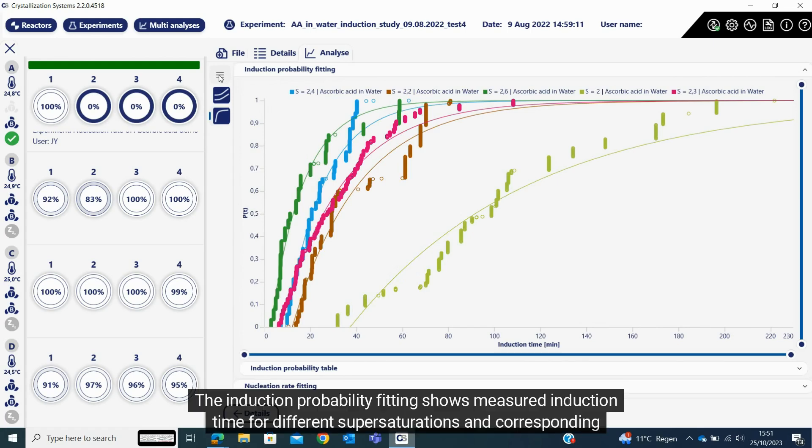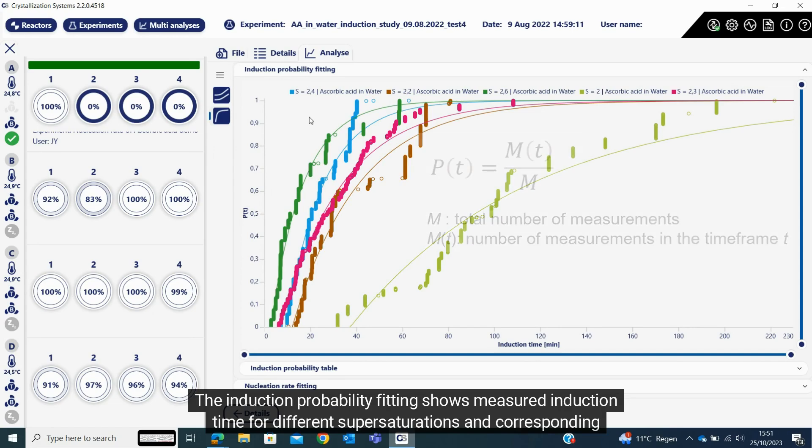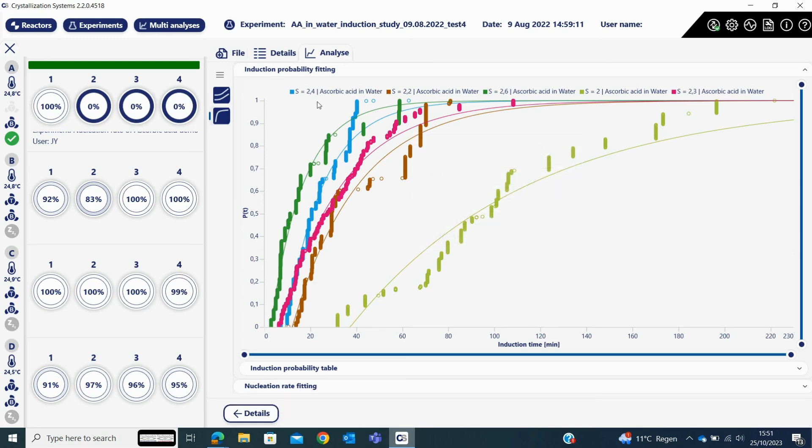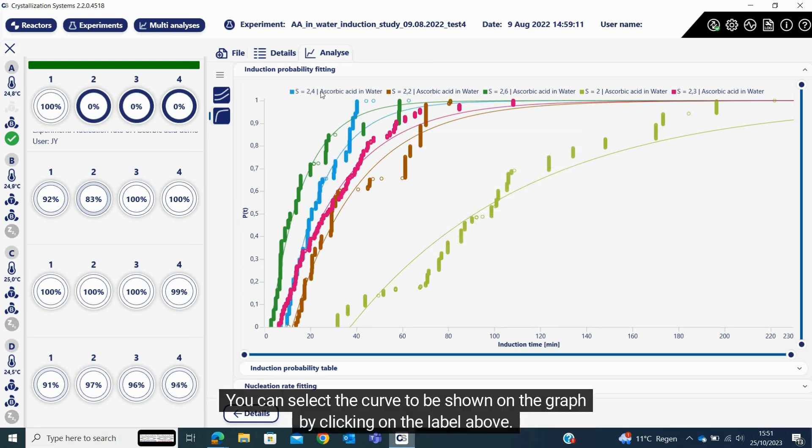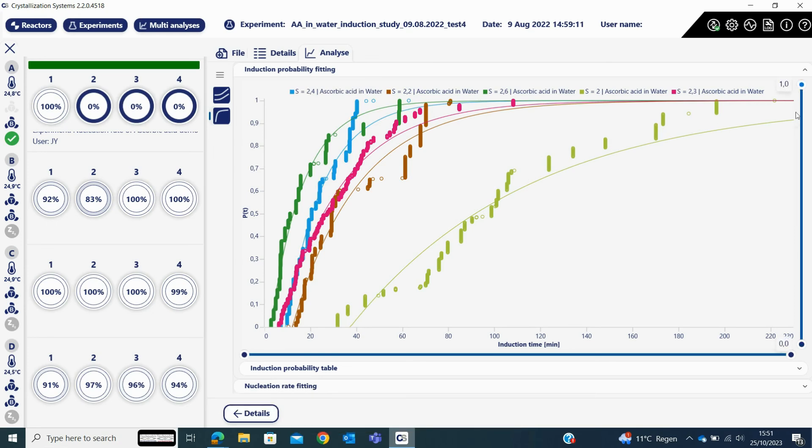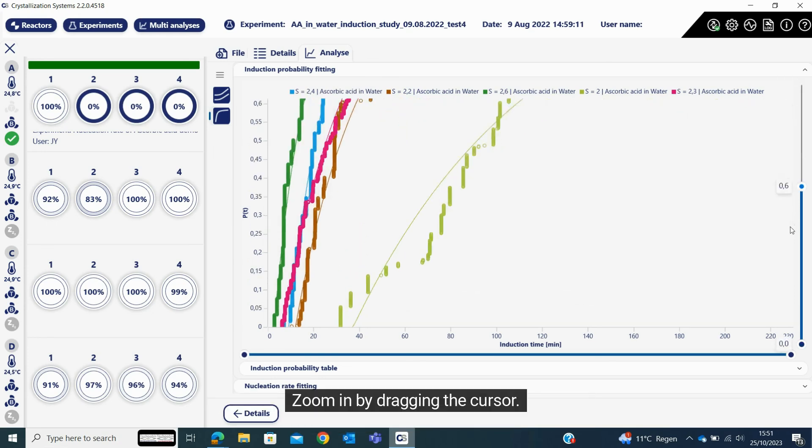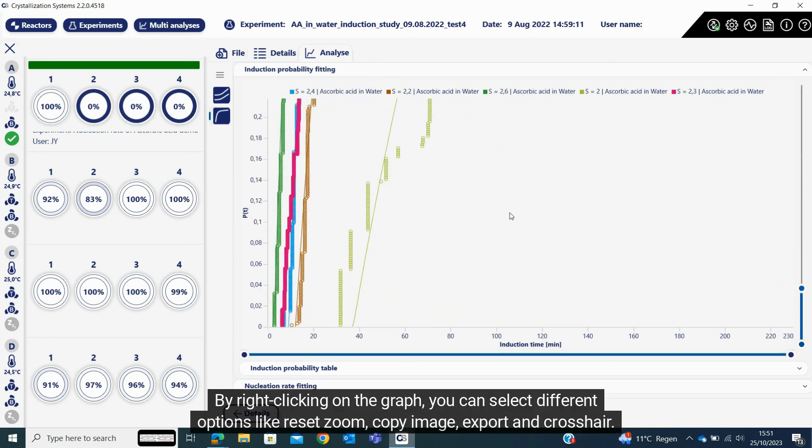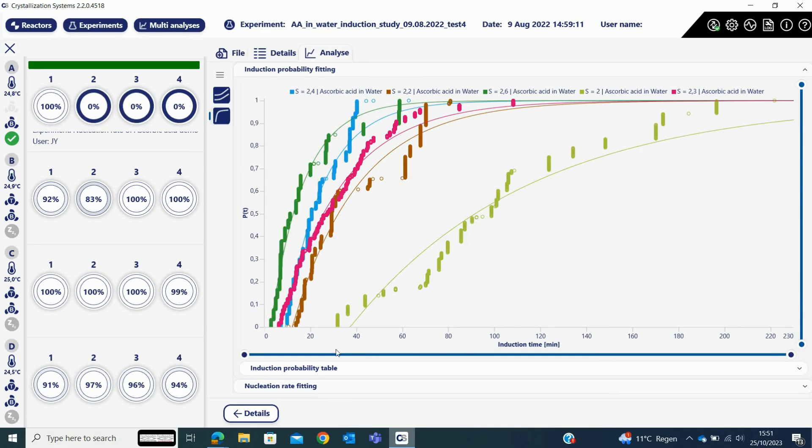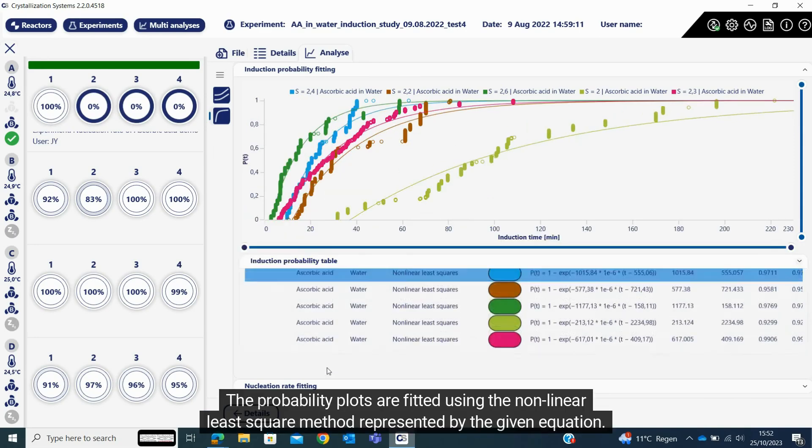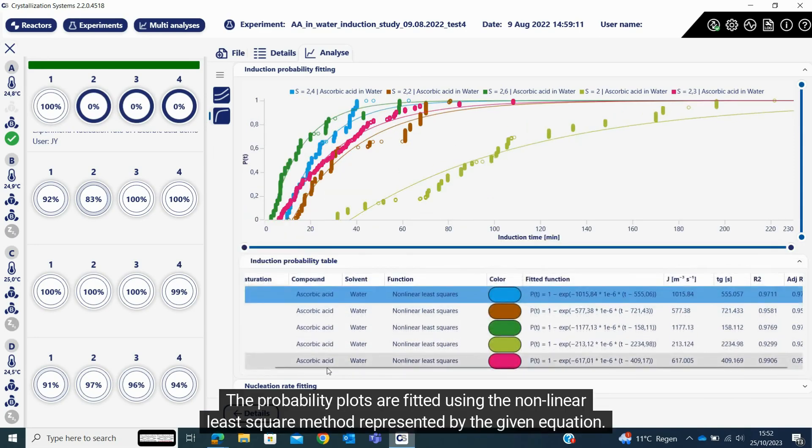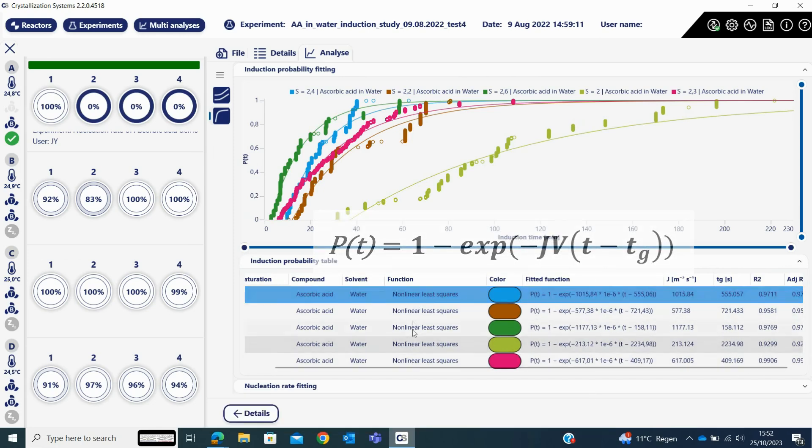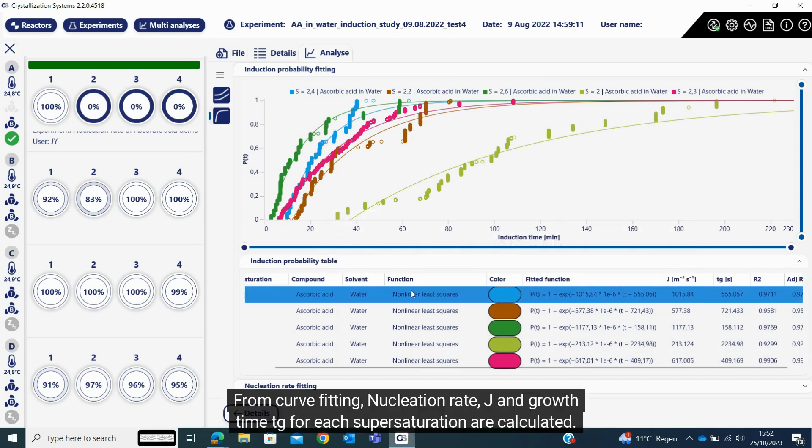The induction probability fitting shows measured induction time for different supersaturations and corresponding probabilities calculated using the given equation. You can select the curve to be shown on the graph by clicking on the label above. Zoom in by dragging the cursor. By right clicking on the graph, you can select different options like reset zoom, copy image, export, and crosshair. The probability plots are fitted using the non-linear least square method represented by the given equation. From curve fitting, nucleation rate J and growth time tg for each supersaturation are calculated.